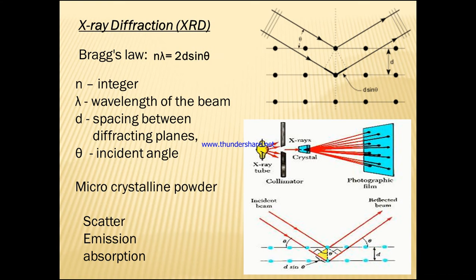So the goniometer is an instrument which is used to make these rays be at an angle. The X-rays are generated by the cathode tube, and a filter is used to produce monochromatic radiation, which is collimated to produce a concentrated beam and directed towards the sample here.